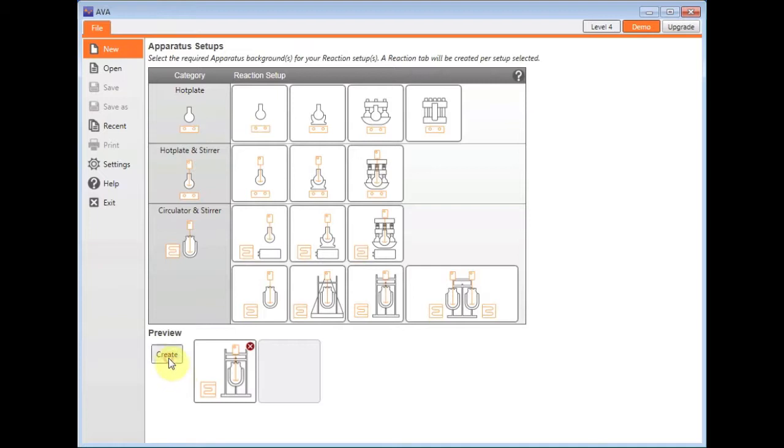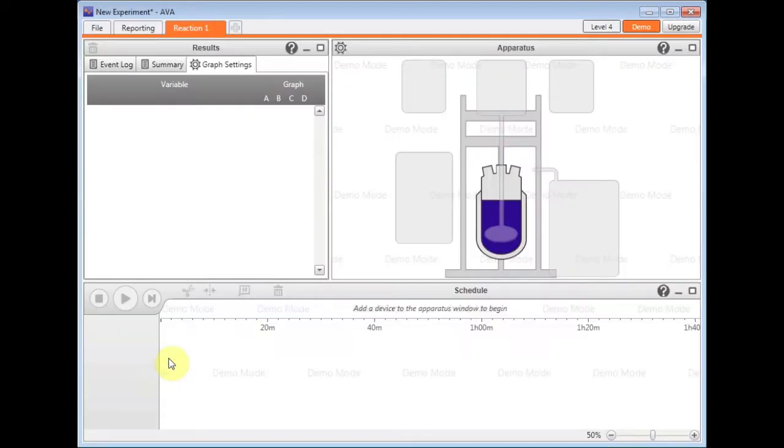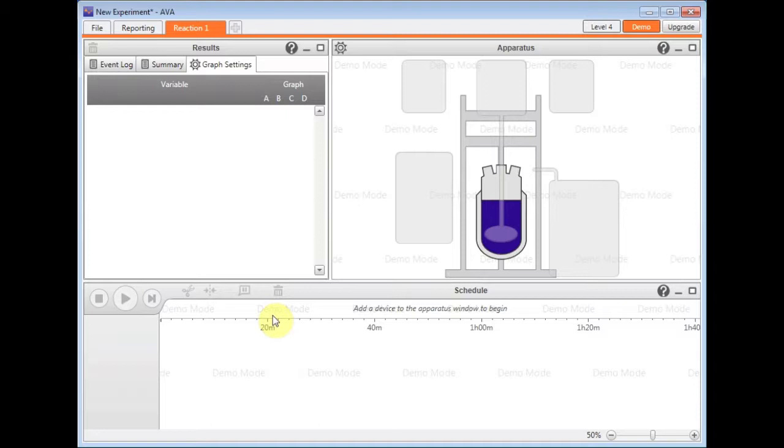I have this window here which has an apparatus section, a results section and a schedule along the bottom. The apparatus window is where I can add my equipment and the schedule is where I can pre-program what I want that apparatus to do if I wish.